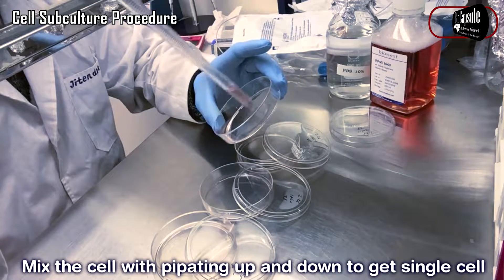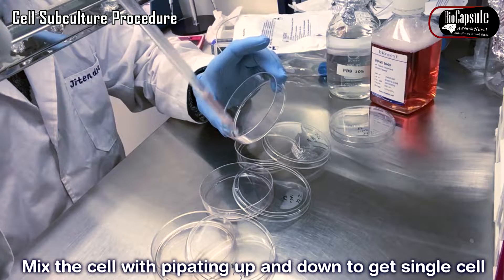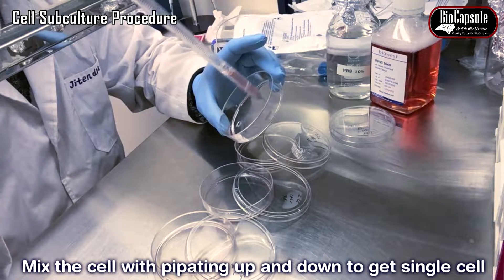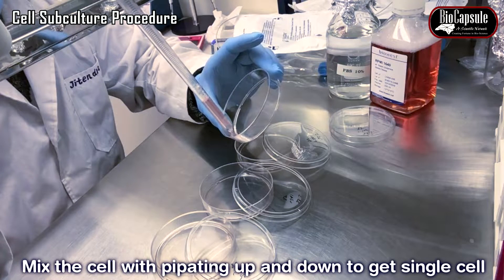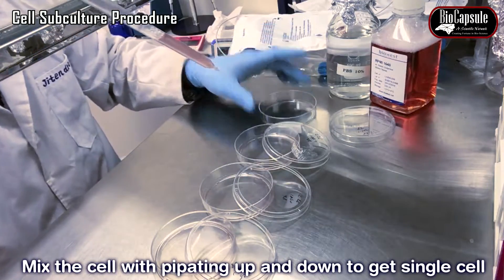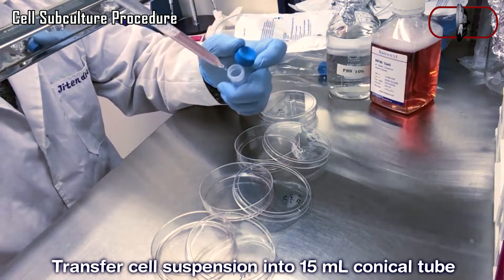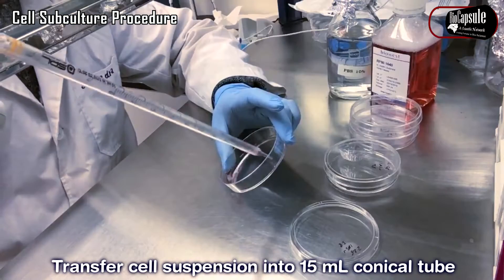Detach and mix the cells with a pipette. Collect the cells with a pipette into a 15 ml conical tube.